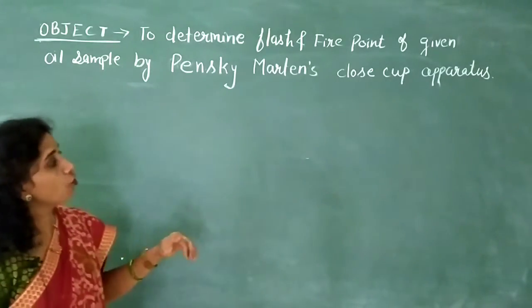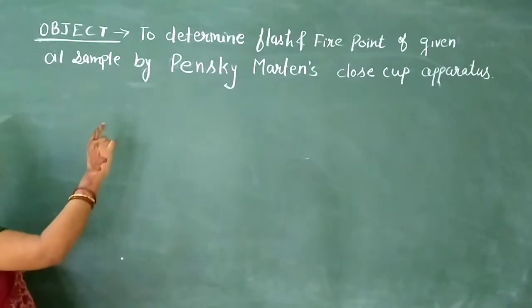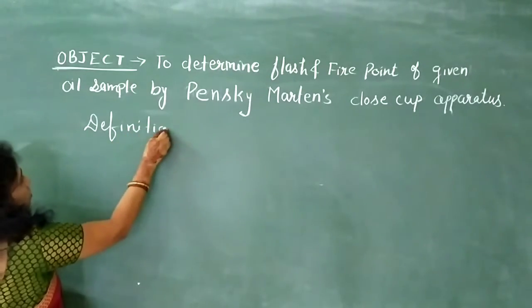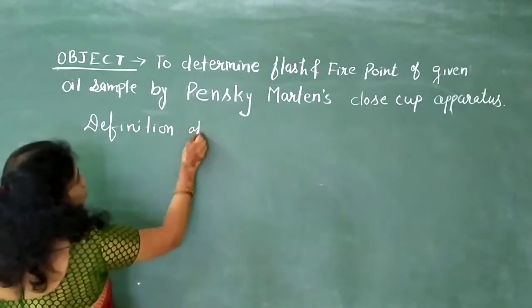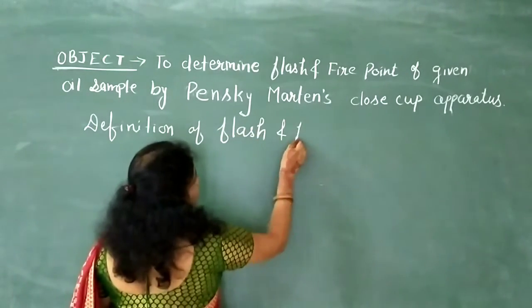First of all, the definition of flash and fire point. You should remember the definition of flash and fire point. It is a very important question for Viva purposes, so you should remember the definition properly.